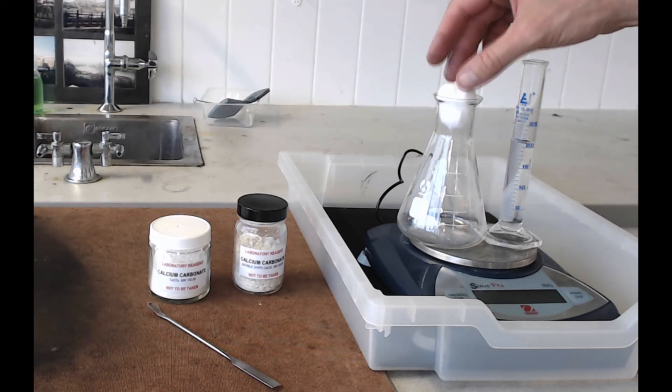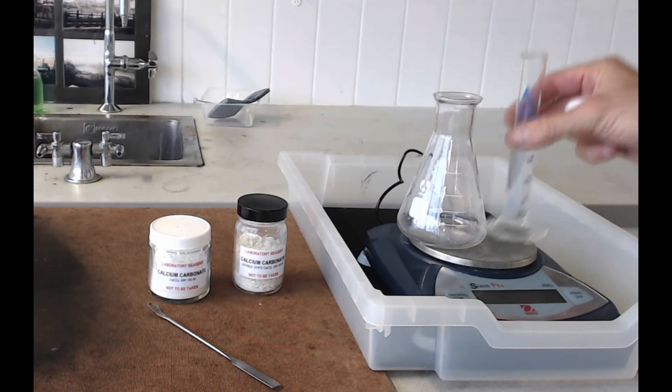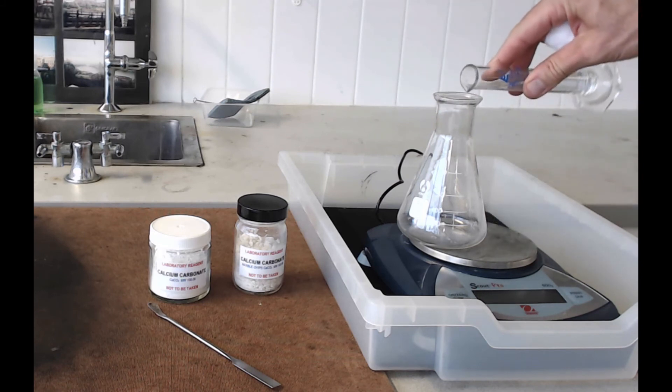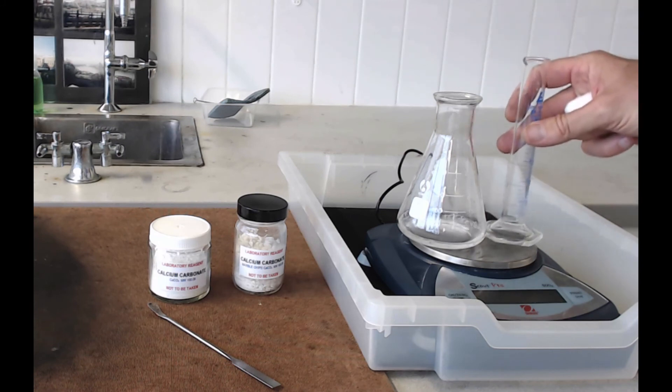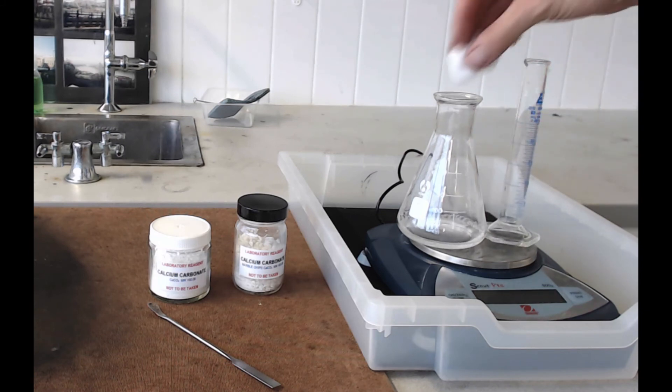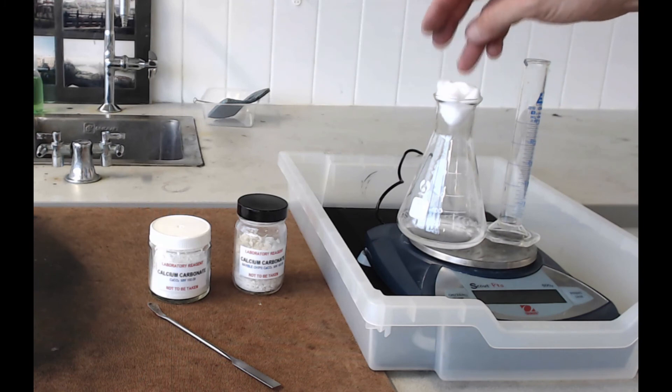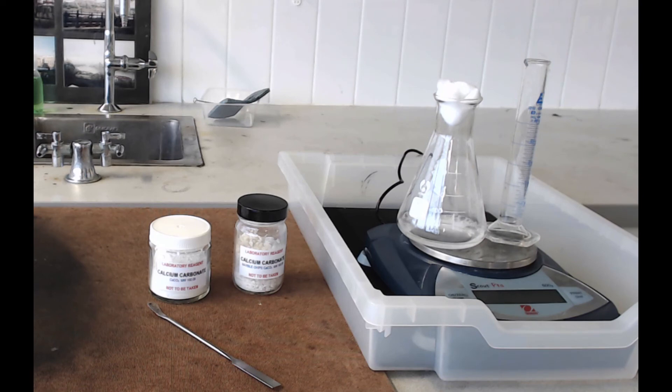Take your cotton bud out, pour your acid into the flask, and put the measuring cylinder back on the balance. That's very important because you're trying to see the mass loss of the whole system. Put the cotton wool bud in - its purpose is to stop any spray escaping from the flask while the reaction fizzes.